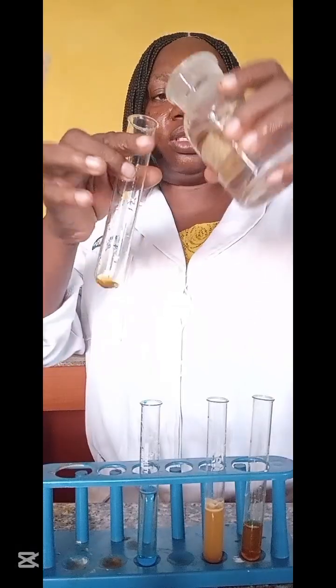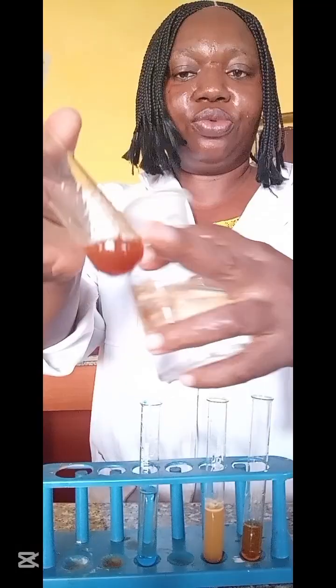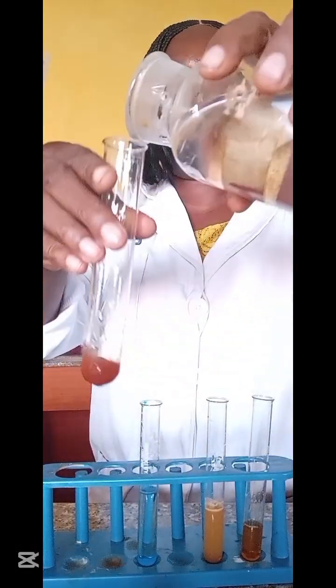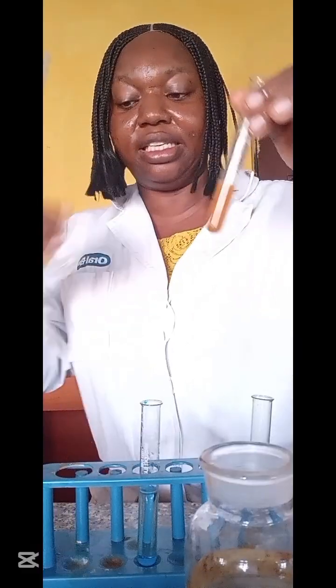Let's test it with ammonia. That's a solution with ammonia. Reddish brown gelatinous precipitate. In excess, the precipitate does not dissolve. Iron 3, whether in sodium hydroxide or in ammonia, the result is the same: reddish brown gelatinous precipitate, insoluble in excess ammonia, insoluble in excess sodium hydroxide. I told you that some iron 2 can also be reddish brown in terms of color, but how we distinguish it is when we test it.